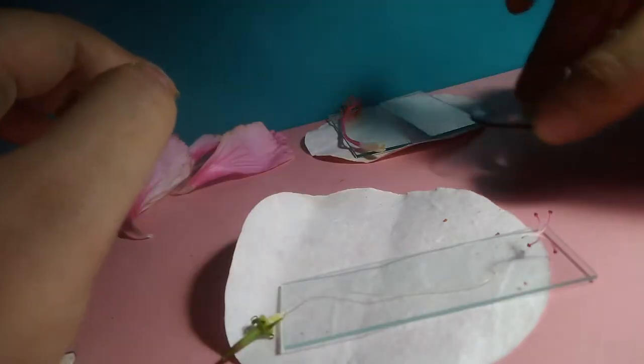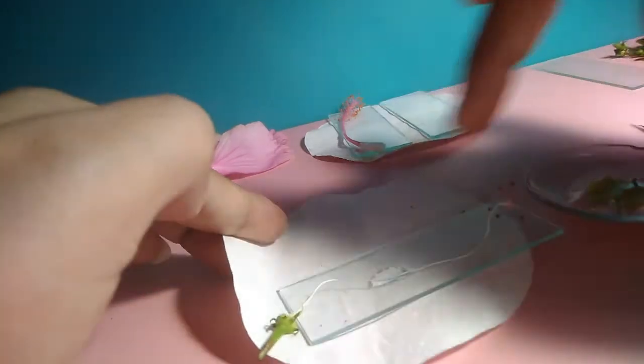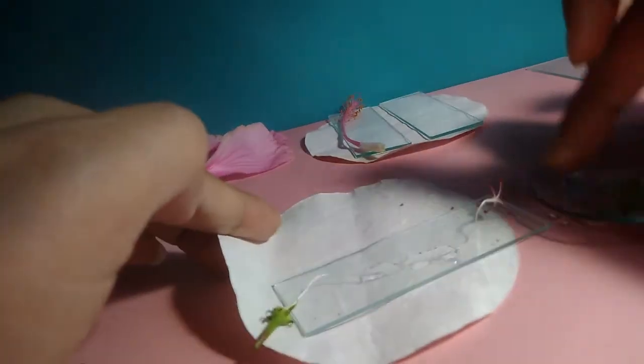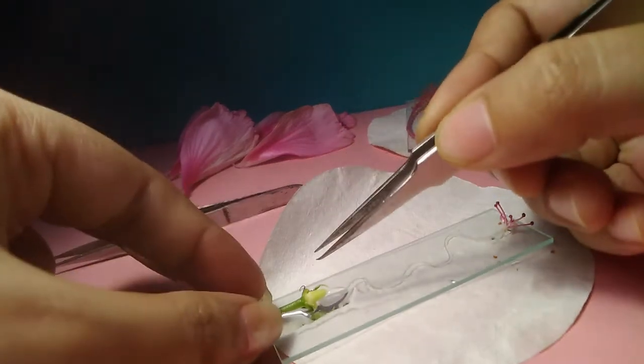Be careful that always try to keep this in water, otherwise it will dry up really quickly. Now that we have completely taken out our pistil or the female reproductive part, so let us clean this ovary a little bit.